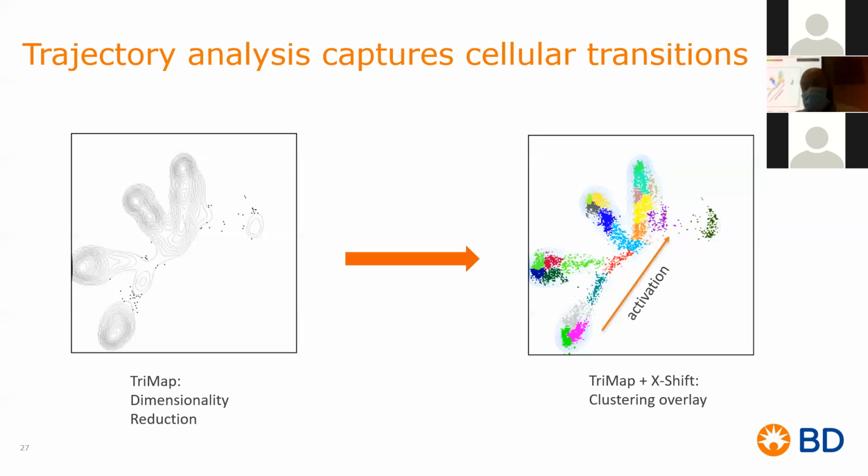So here, when I did this and I start scrutinizing my different clusters, what I found out is that you go from lowest level of activation to the highest level of activation, following those different areas. This you could not see with TSNE. So why did I run TSNE?